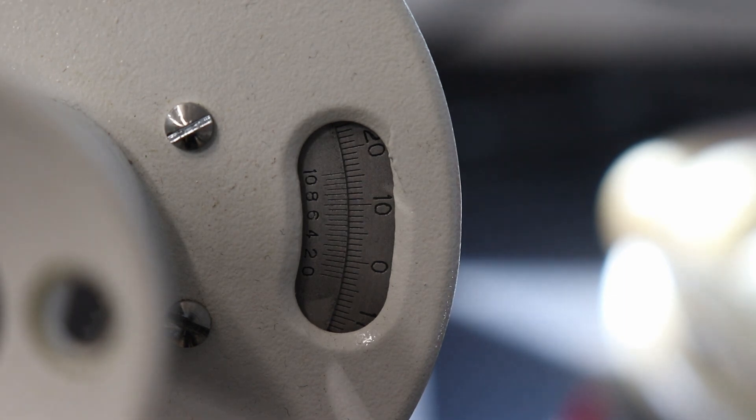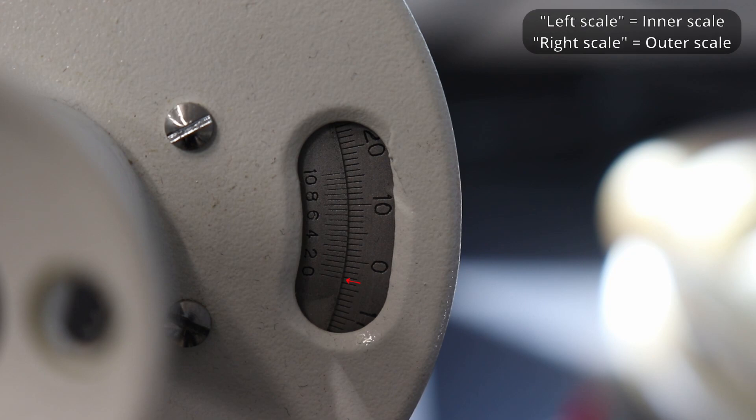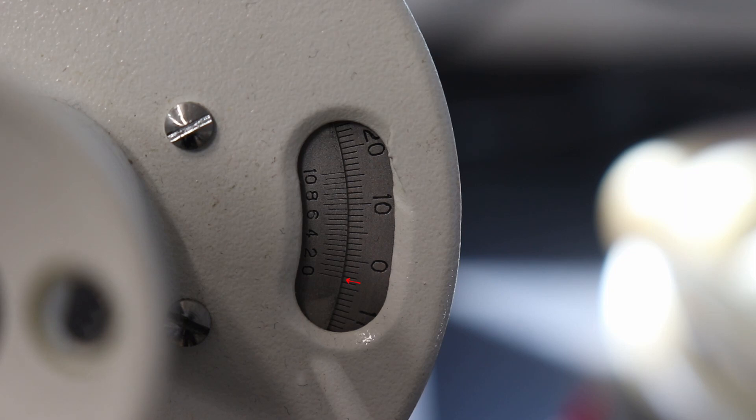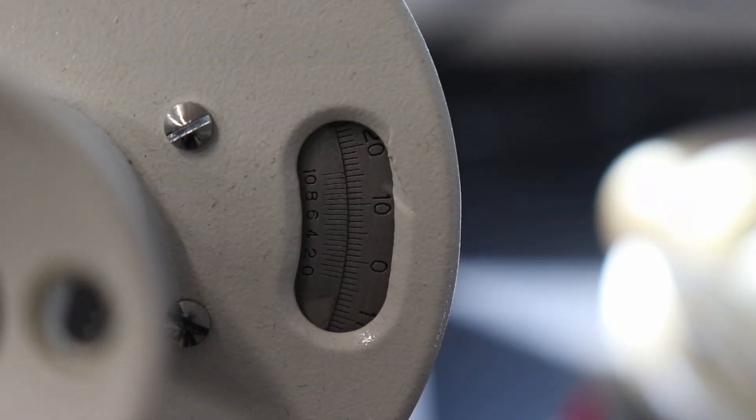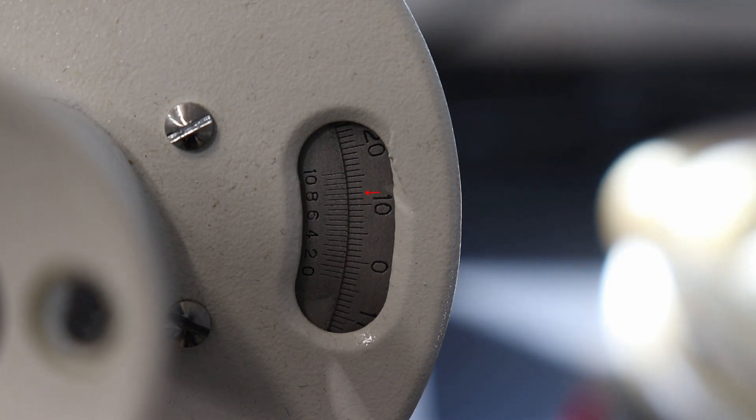To read the vernier scale, first look at the zero on the left scale and where that lines up with an integer value on the right scale. In this case, negative 3 since we're below the zero. And then to read the decimal place, look at both scales and where the two graduations meet perfectly will read the decimal off the left scale. In this case, the value is 8.